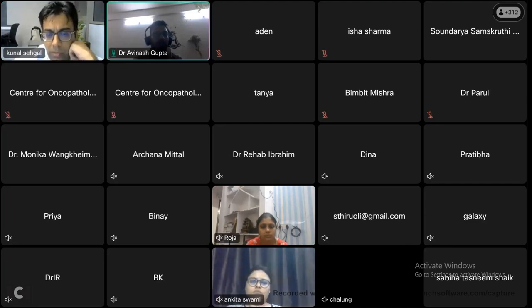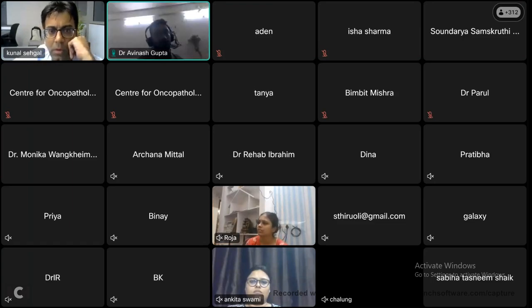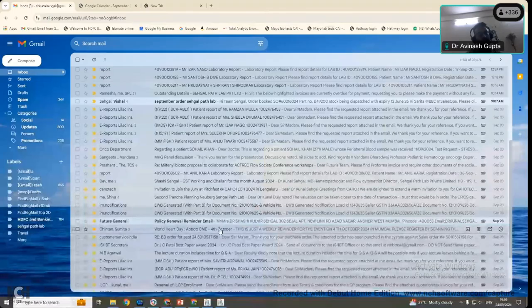Sure. Yeah, so I think that minimum event should be 1 lakh, because I have seen few cases where we are missing some of the blast minute population, which is less than 1%. And when we acquire more event around 1 lakh, we got that minute clone. So otherwise we were missing that clone. So if we are acquiring more event, if we can.